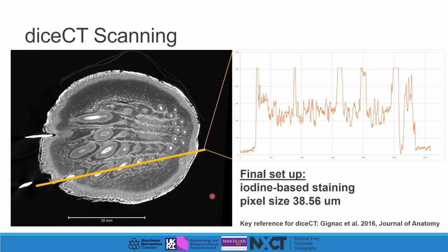The next challenge was to analyse the data. The most straightforward image data of any type to analyse is that with high contrast between the major features with minimum overlap in the grayscale values. Unfortunately, biological samples, like our example here, have a large amount of overlap between the grayscale values of the features of interest. However, we can see the shape and texture contrast easily with the human eye.